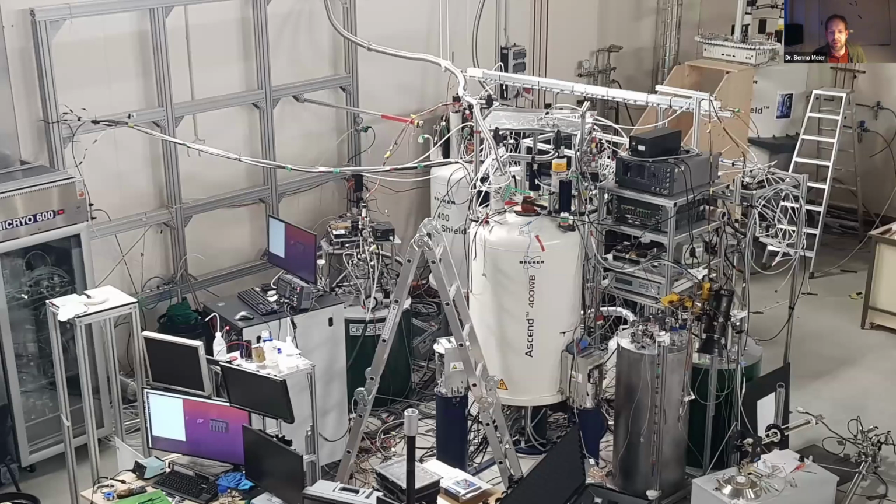So I will show you now how we do this in our lab. So this is again the messy lab picture. And you see here on the left hand, there's a fridge and there's what we call the autoloader. And that's where we prepare the bullets. You see in a moment how that is done. And once they are prepared, we shoot them through these cables here. And they go all the way to somewhere over here.